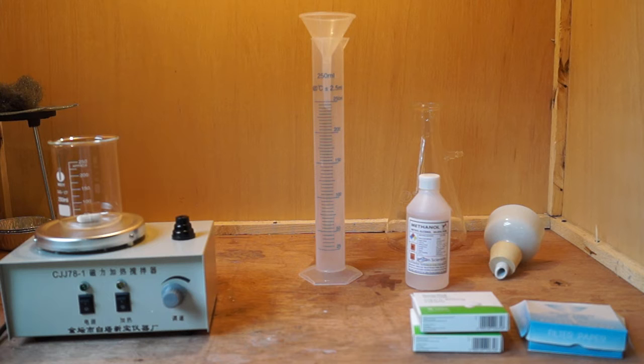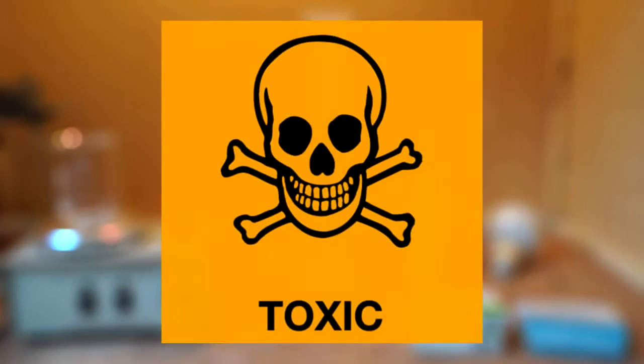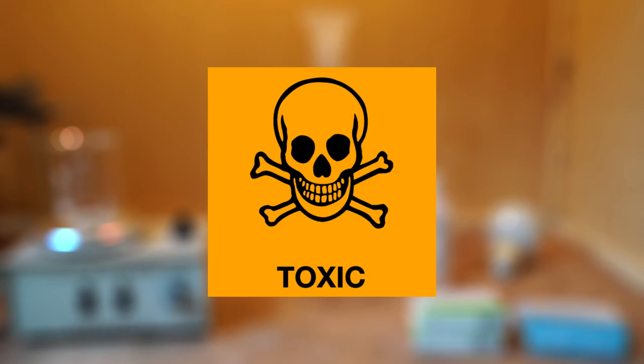In the first step, I will be using a solvent in which aspirin is particularly soluble in. Isopropanol can be used, although I recommend using acetone. In this demonstration, I will use some methanol I had left over from a previous video. Methanol is toxic, thus I would avoid using it if you have the choice.